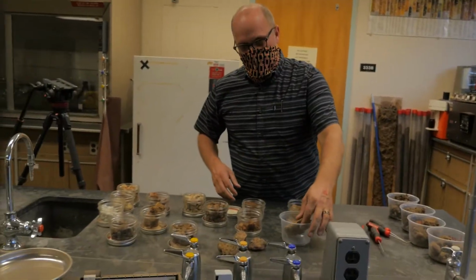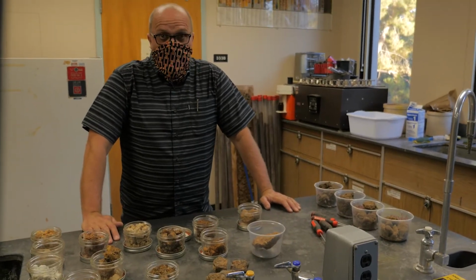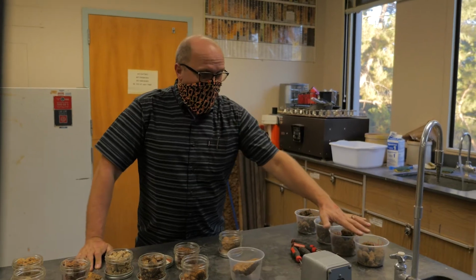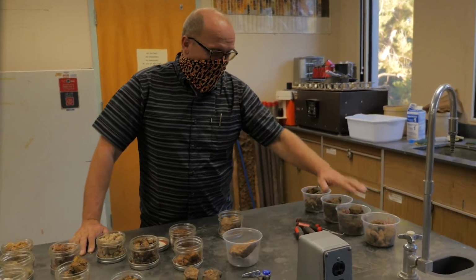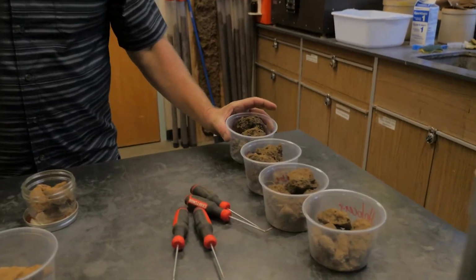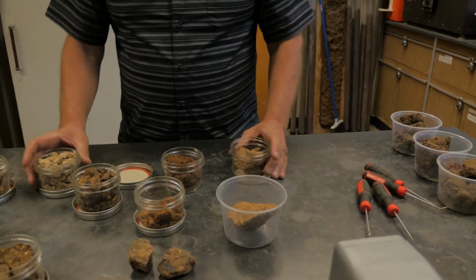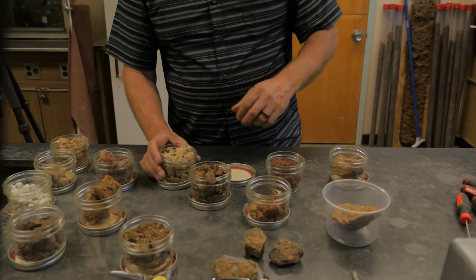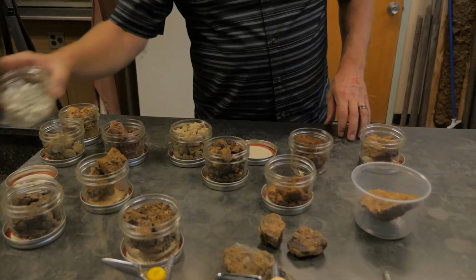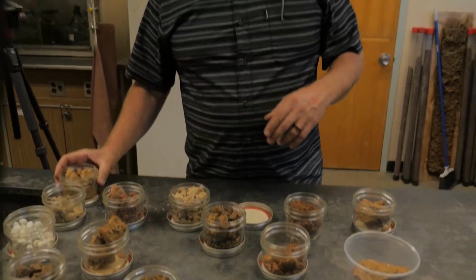Here's just an array of different samples that we've collected over the last handful of years in different adventures around Chico and actually across the state. Right here we have the pit that we've been talking about up to this point. We have the surface through subsoil of what we've been calling the Holocene pit. Here we go. We've got some other various things of different colors, reds, light colors, chalky materials, weird round things that look like yogurt covered raisins, things with sand and obvious young development, and a few others.